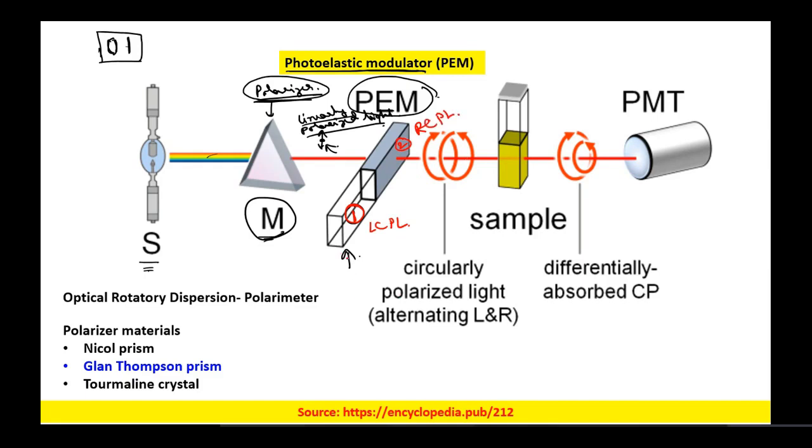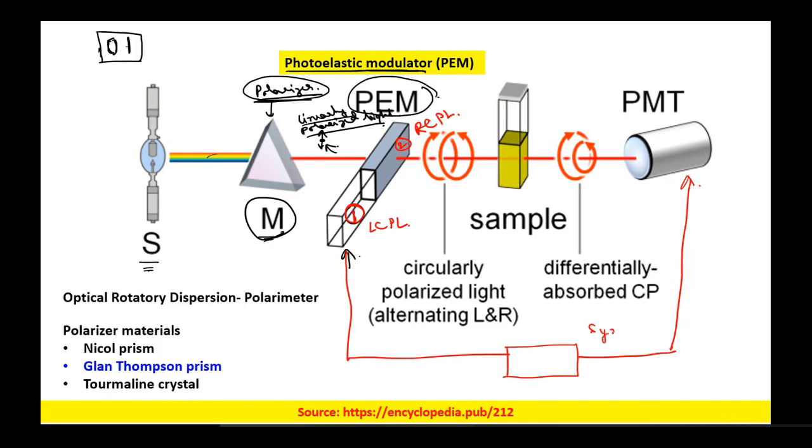So this PEM and the PMT are synchronized using a computer program.